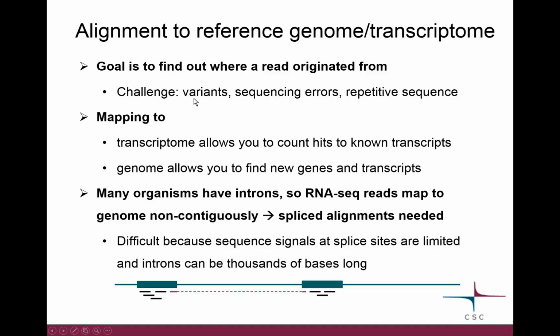Now, computers are very good at matching text, essentially, to make exact matching, but here there are some things that make this matching a bit more challenging to the programs. So first of all, the matches are most probably not going to be exact because, of course, individuals have variants in their genome.